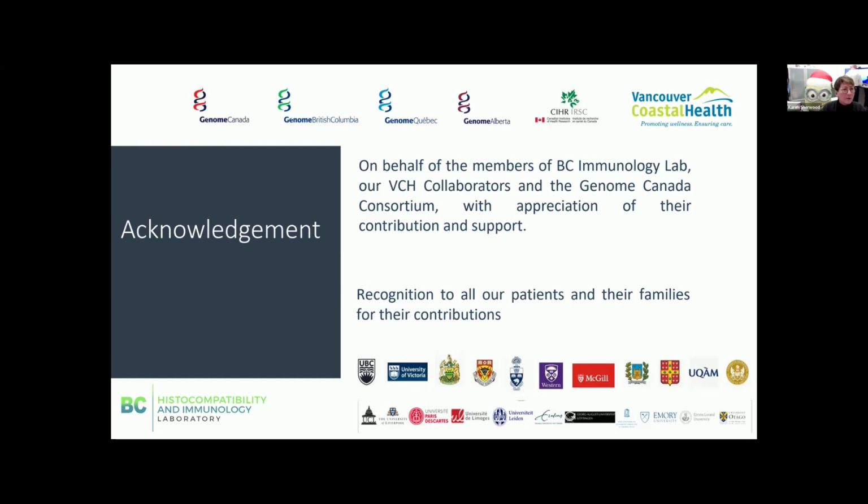Sorry, was the question about long read hybrid capture or short read hybrid capture? A long read, but is CareDx long read? No, CareDx is not long read, it's short read. Yes, the Illumina-based hybrid capture with a drop-in for ABO is also hybrid capture, but it's short read. I don't know if there is a long read hybrid capture format. Yeah, I don't know as well.